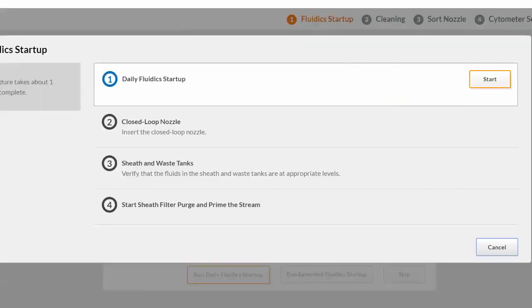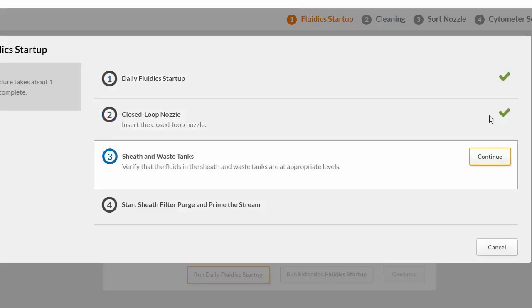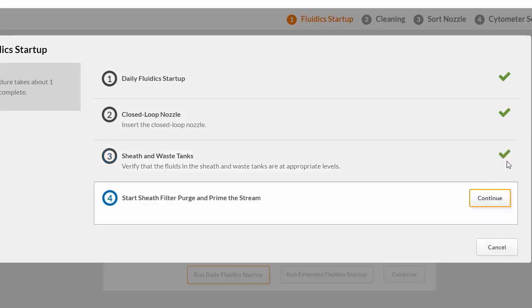There are four steps to complete the Daily Fluidics Startup. Click Start and just follow the prompts to complete the tasks. A green check mark appears as each task is successfully completed.